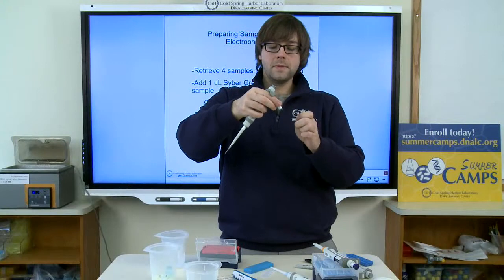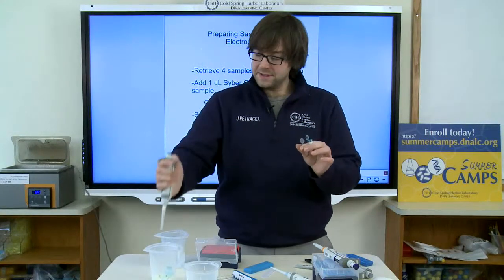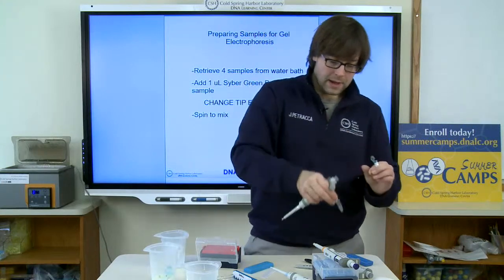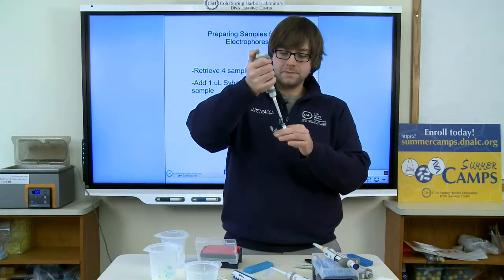Okay, I'm going to do the same thing for the minus tube and the question mark tube as well.